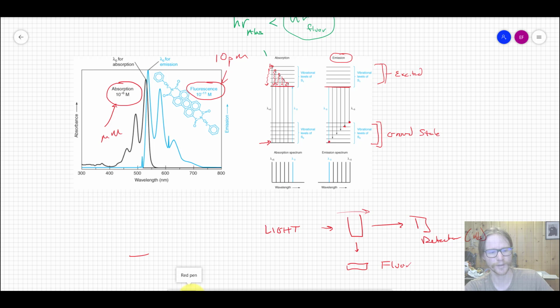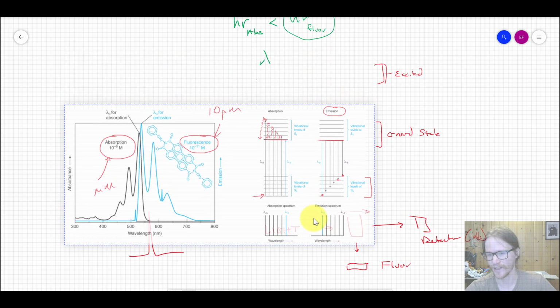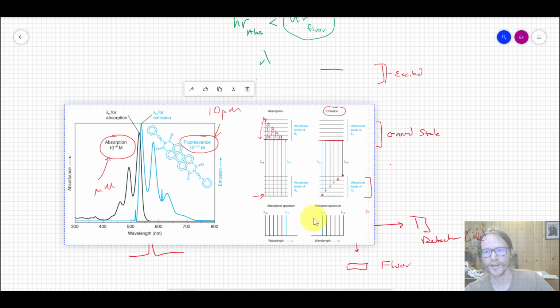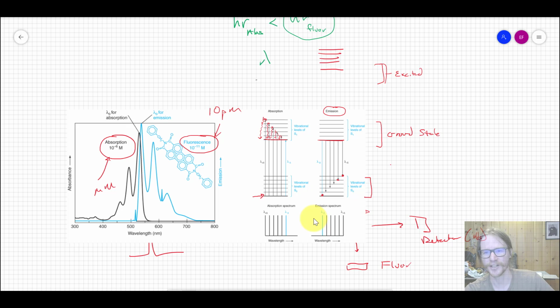You're not getting simply a single band of fluorescence. You're getting essentially like an imprint of all of the vibrational states in that molecule, at least within that first electronic excitation. If it's not clear, there are many electronic excitations. I mentioned this in a previous video. So whatever you see here, imagine that there's then on top of this another set of bands of vibrational levels up here, which would be the n equals 3 state.